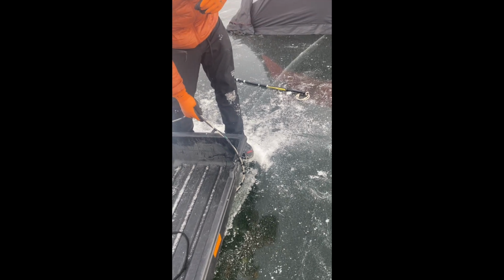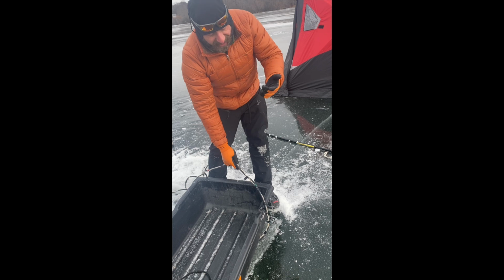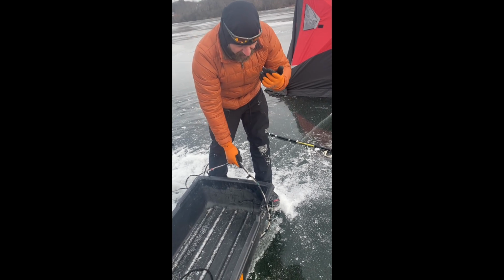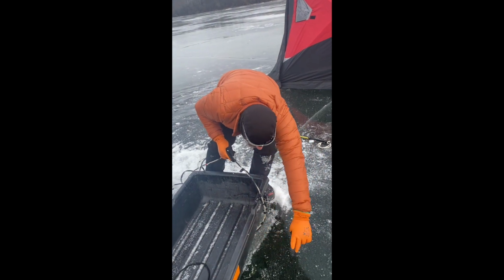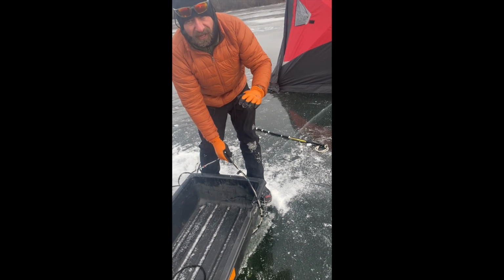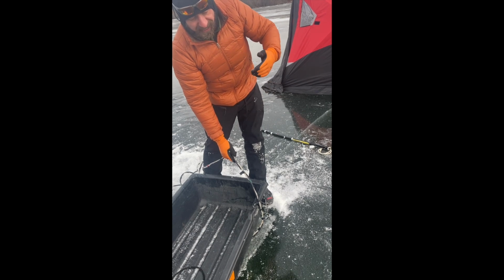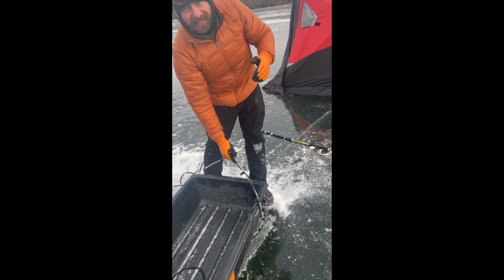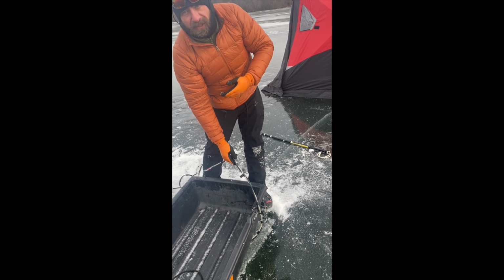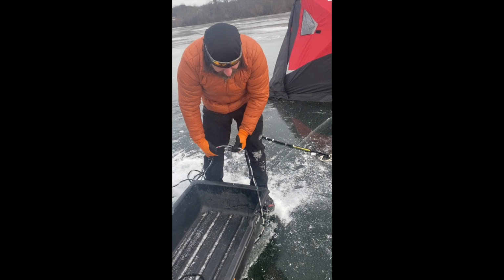And we're going to do this in half-meter intervals to 3-meter depth. So again, if there was snow on the ice, at the end of the water column profile, it would come back up and then clear the snow off of this area of ice and collect another measurement through the ice without snow this time. And then we would get a measurement of light attenuation through snow and ice, and attenuation through just ice, and then attenuation through the water column, and we can separate these things apart. 43.85. Okay.